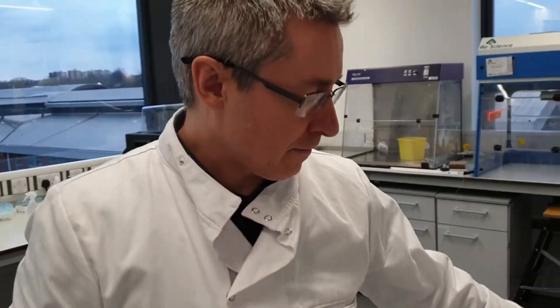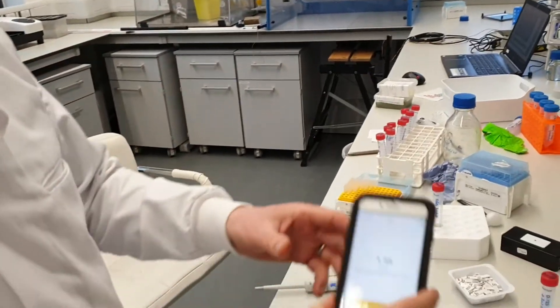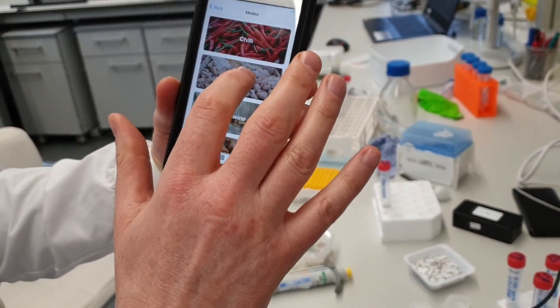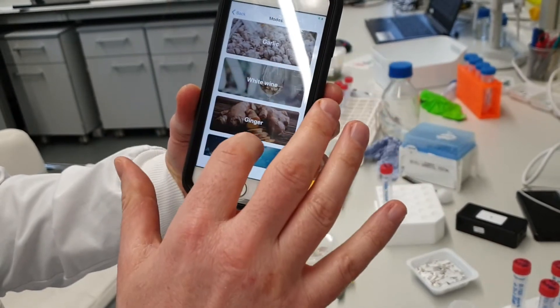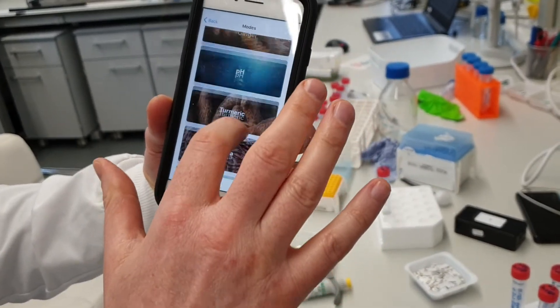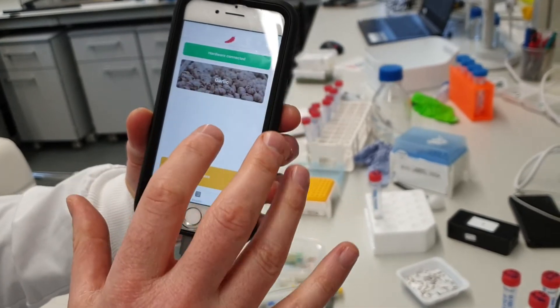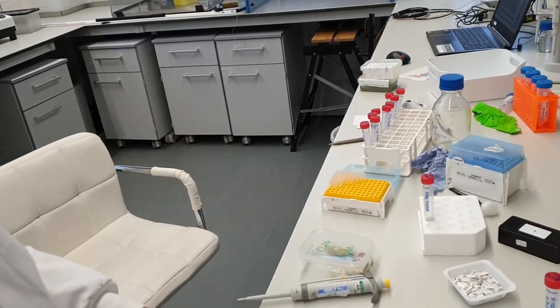We're going to go to the Food Sense app. The Food Sense allows us to do chili, garlic, white wine, sulfite in white wine, ginger, pH, turmeric, vanilla, and E. coli. We'll choose the garlic option this afternoon.